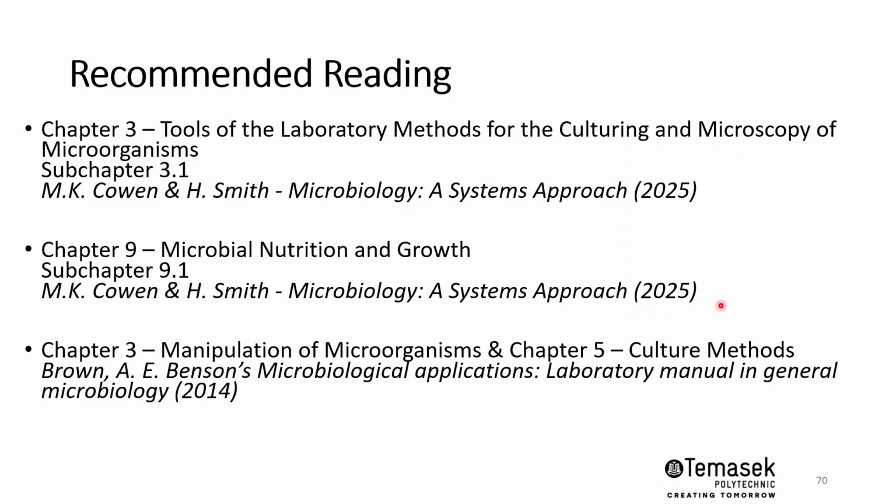In terms of the culture methods and also the manipulation of microbes, you can find more information in chapter 3 and chapter 5 of the text by Benson's Microbiological Applications. This is available in the library as well.